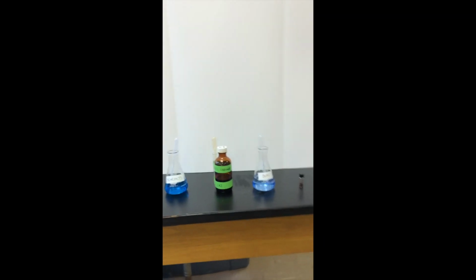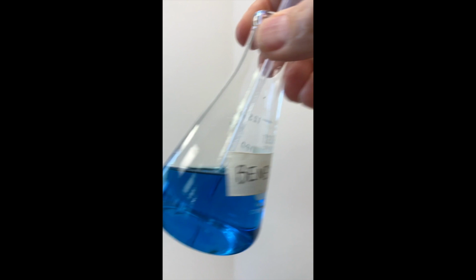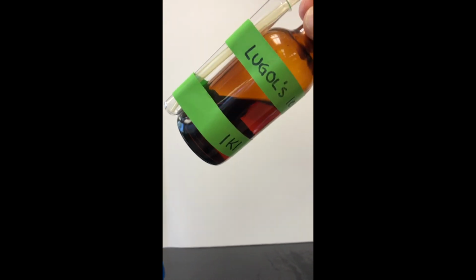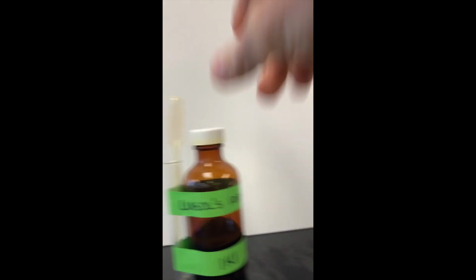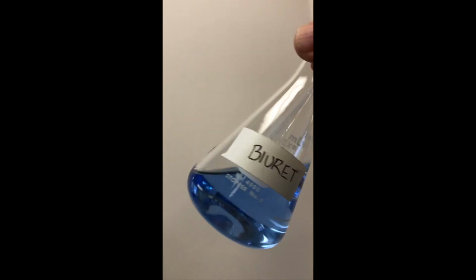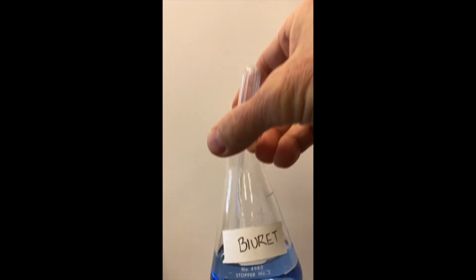The reagents you will be using are Benedict's solution for determining the presence of monosaccharides, simple sugars like glucose and fructose. Lugol's potassium iodide for determining the presence of polysaccharides, like starch. Biuret solution for determining the presence of proteins. And finally, oil red O powder for determining the presence of hydrophobic or non-polar substances, like lipids.